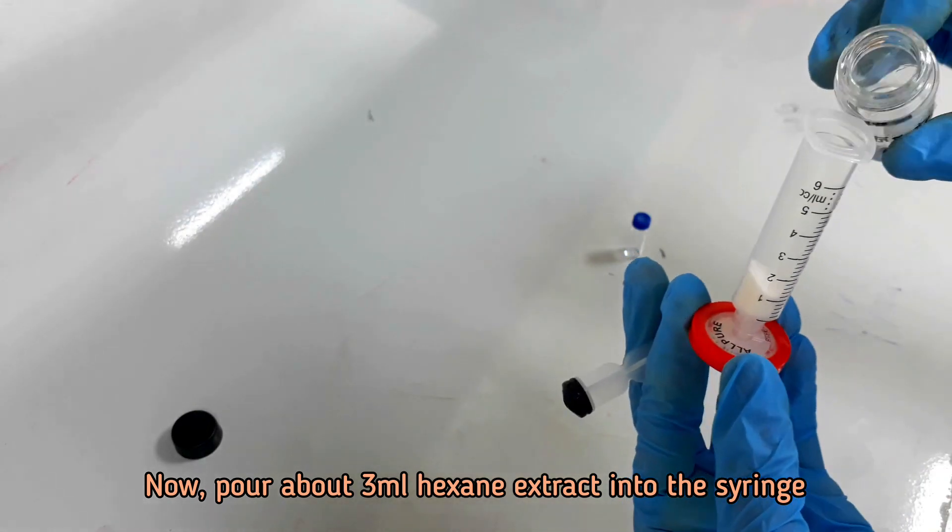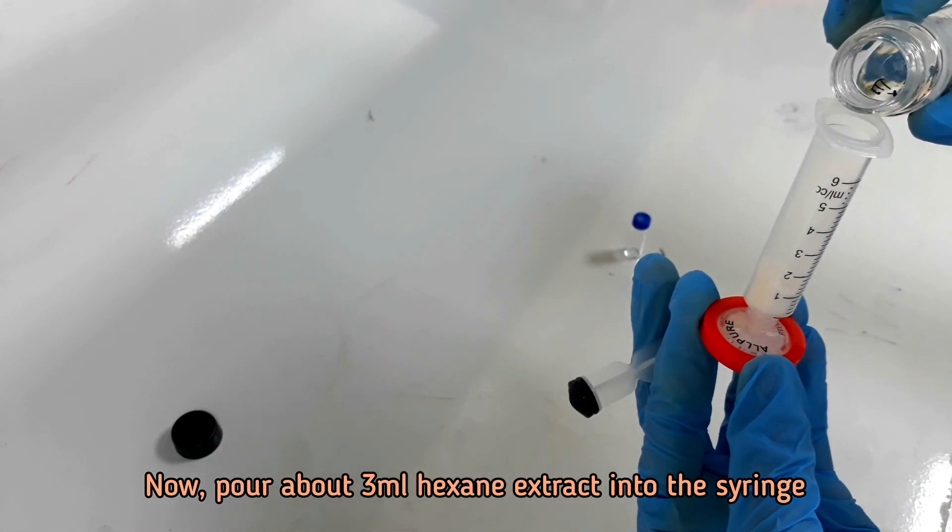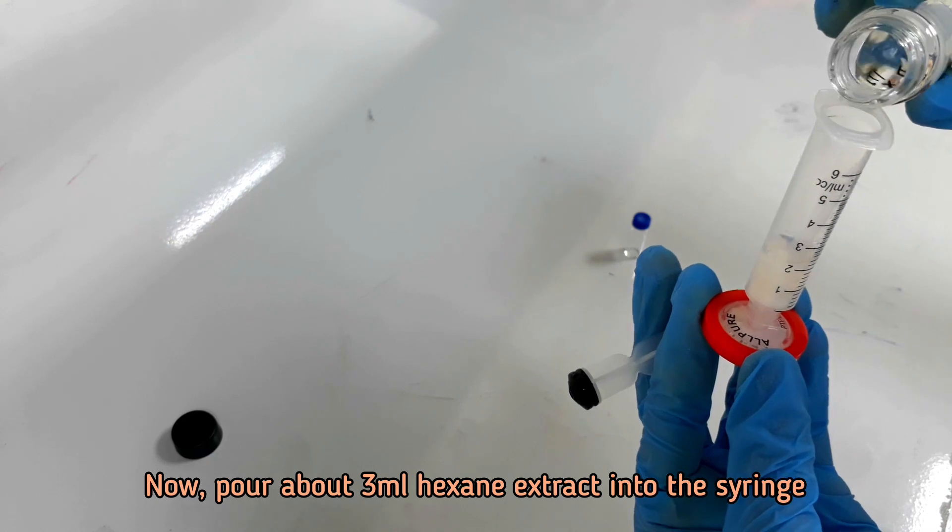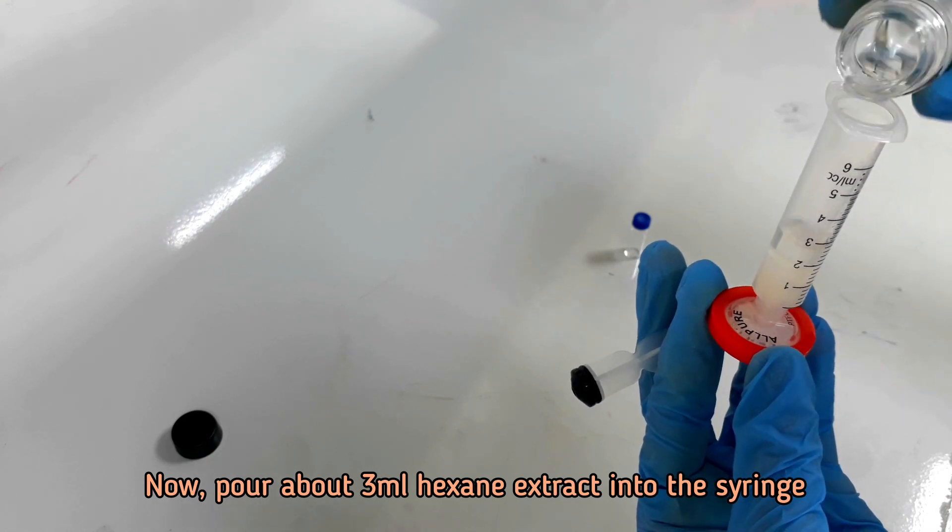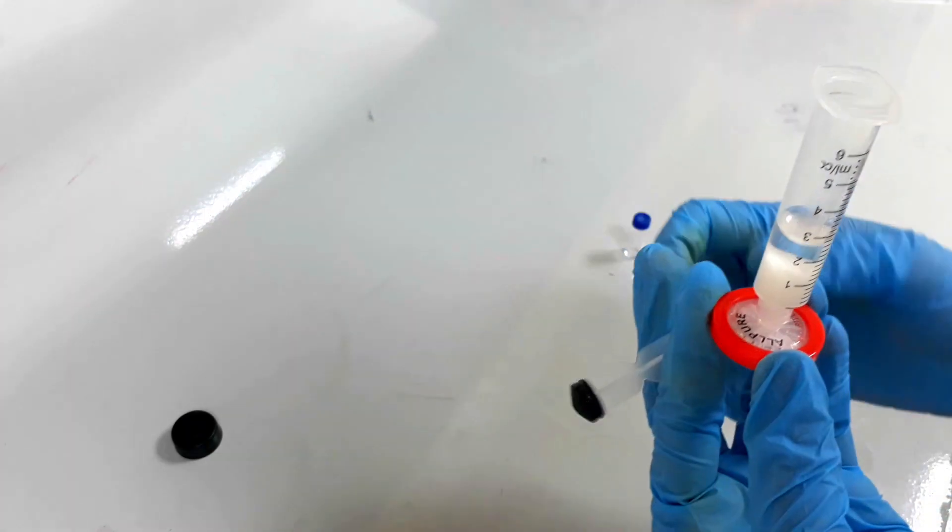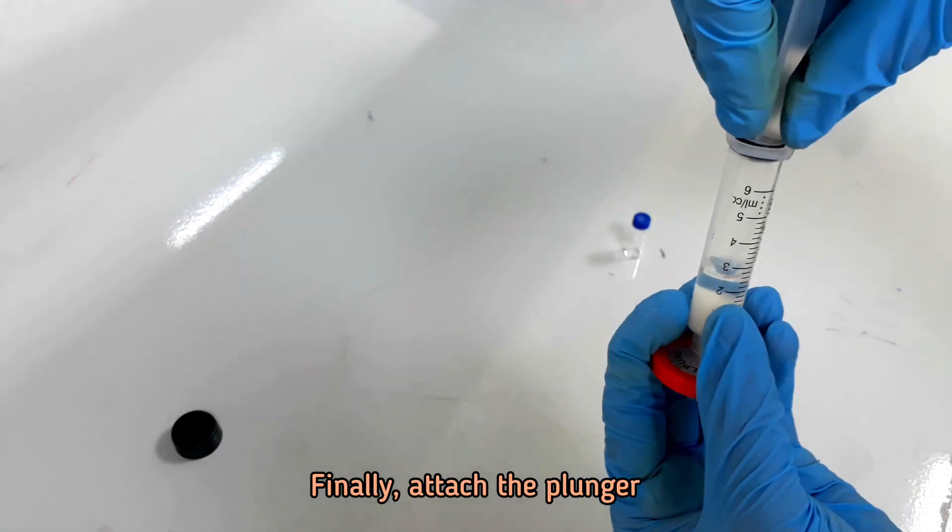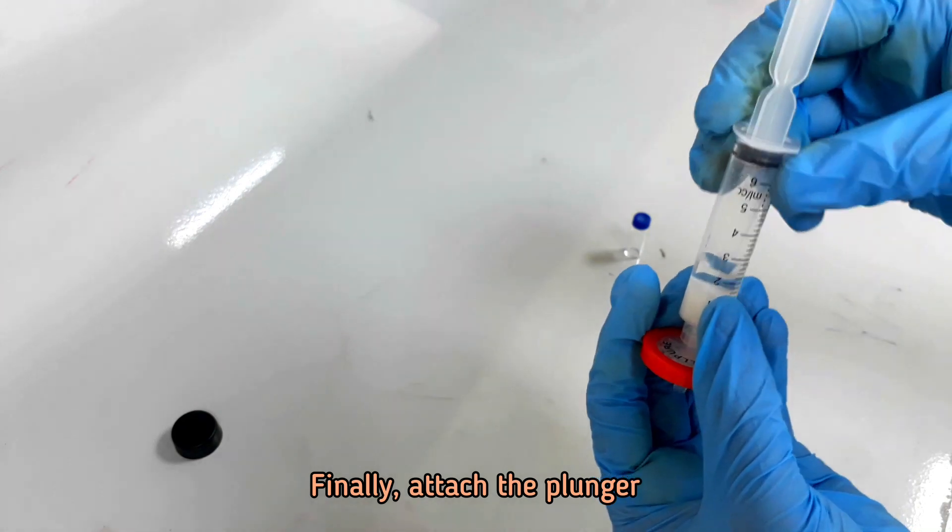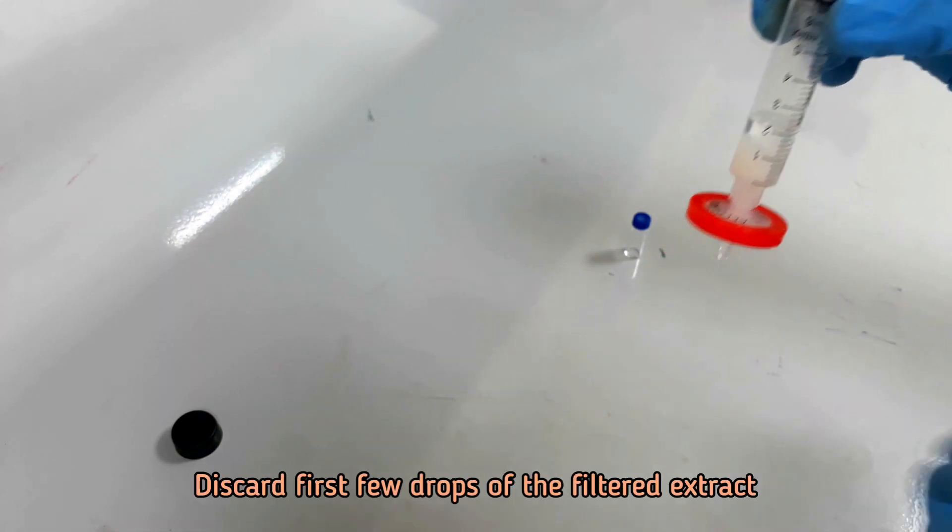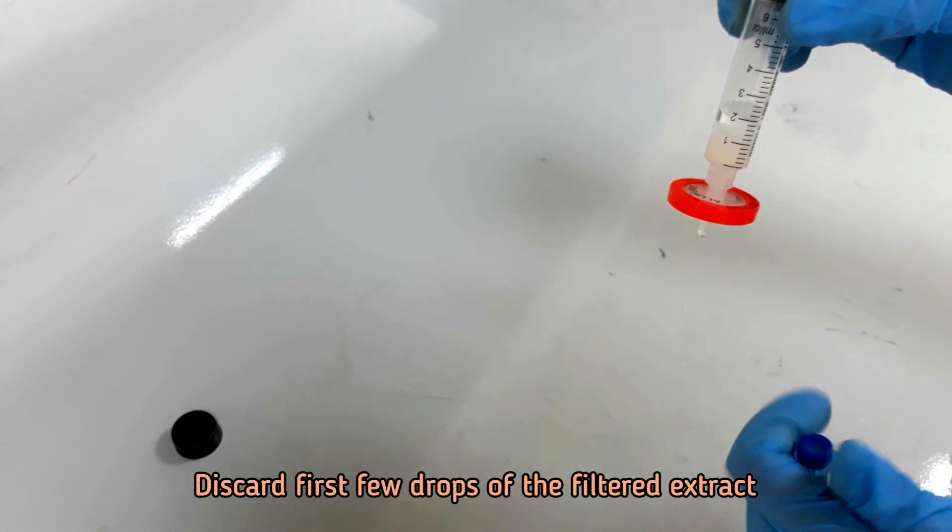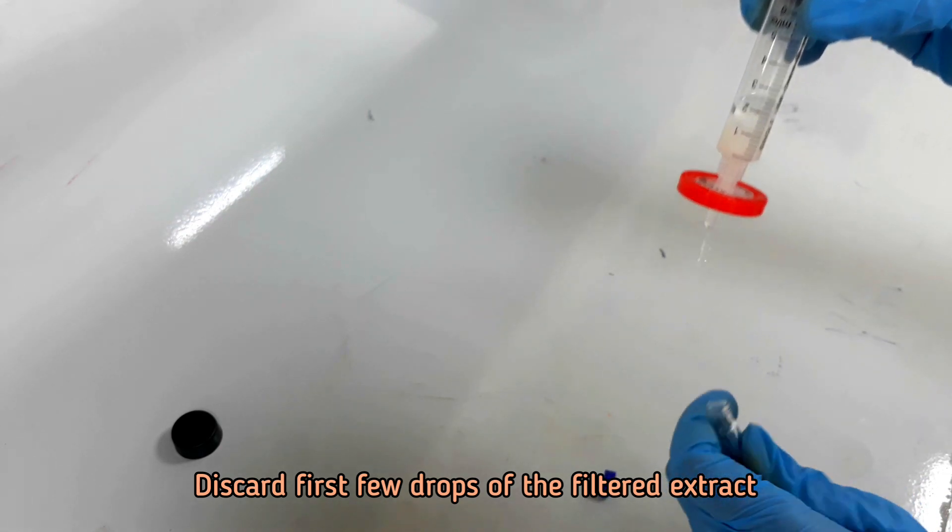Pour about 3 ml hexane extract into the syringe and insert the plunger. Discard first few drops of the filtered extract and then take about 1 ml into the injection vial.